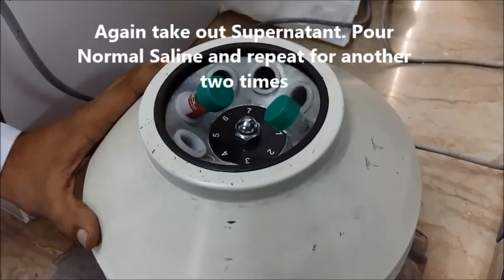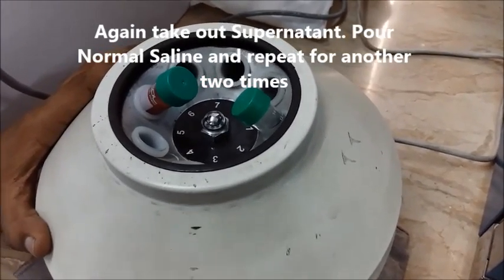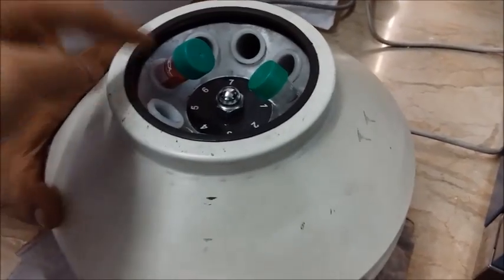We have placed the whole thing back into the centrifugation machine. You are supposed to repeat this whole process about 3 times until the supernatant is clear.